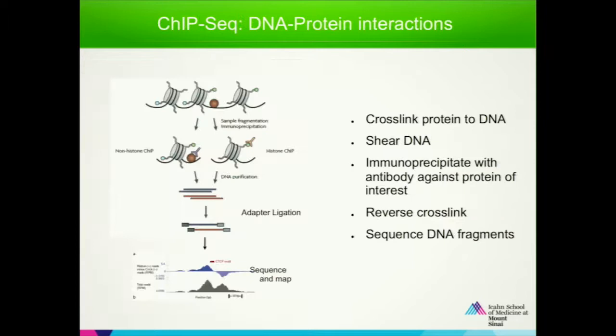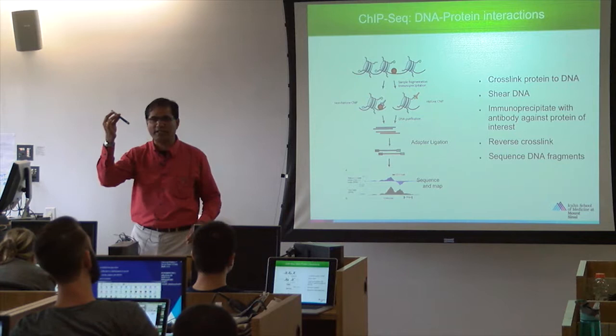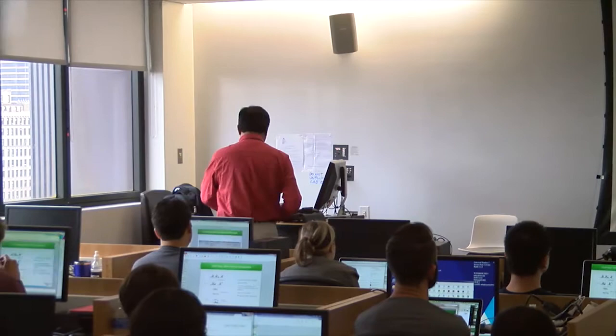What else can you do? You can also do ChIP. I explained earlier that you use formaldehyde, pull it down, and get these strands. Instead of microarray, add these adapters and sequence the entire human genome. You get nucleotide-level resolution, at around 50 or 100 base pairs, each single nucleotide. That is the maximum resolution we can get from the human genome or transcriptome. It is real molecular biology information at the molecular level.